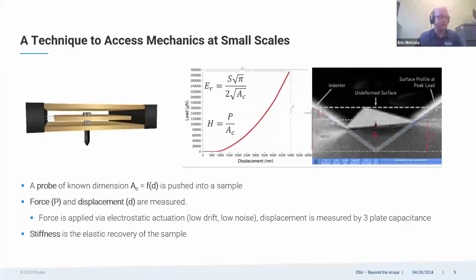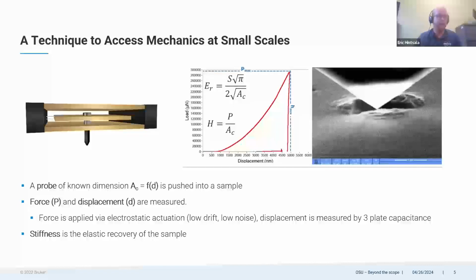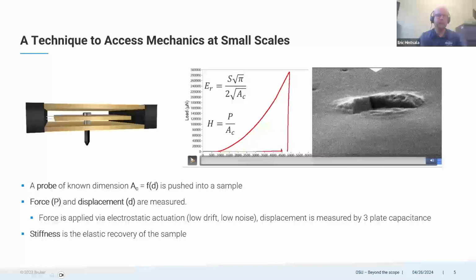A matter of seconds or even sub-second, in fact. And the fact that we can do thousands to millions of tests on one sample that's been prepared means that it can be pretty high throughput in terms of just getting a lot of tests out on one sample if you're trying to get some statistics out. And we can still get at the local elastic and plastic properties. That's what's kind of shown in that animation.